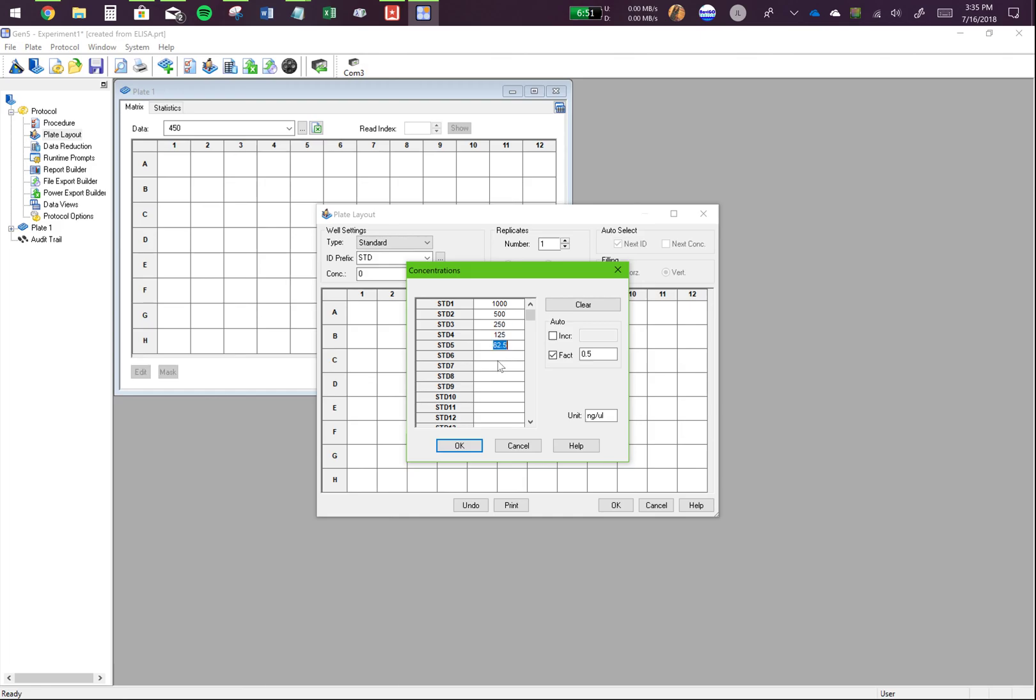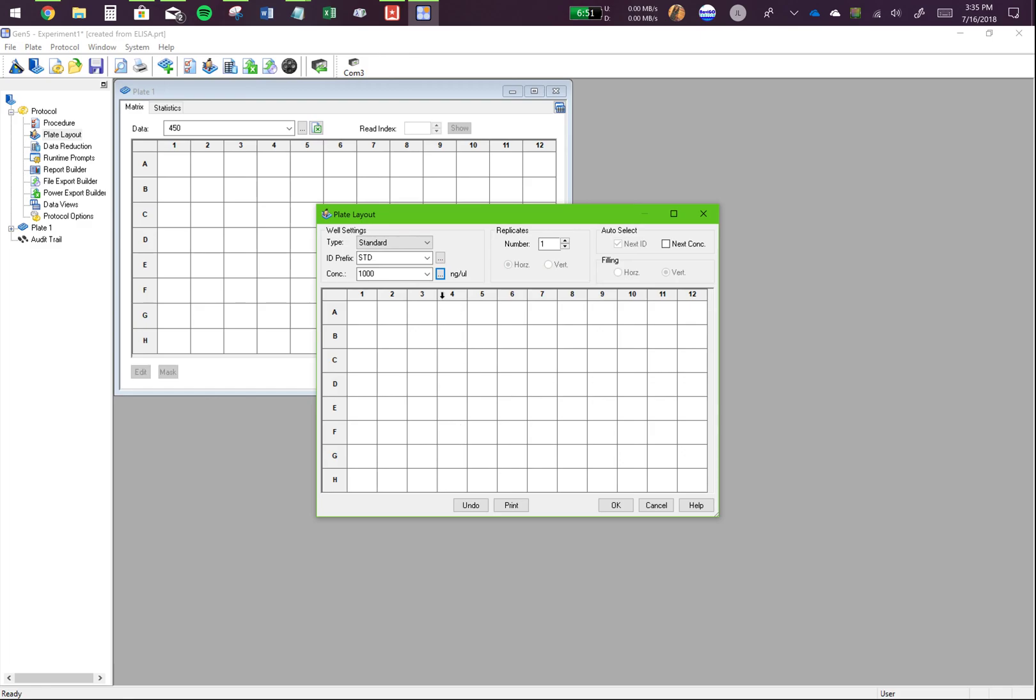I'll do it till 7 standard. But it will totally depend on your experiment. If you've made 12 standards, please go ahead and add the values to 12 standards. Click OK.